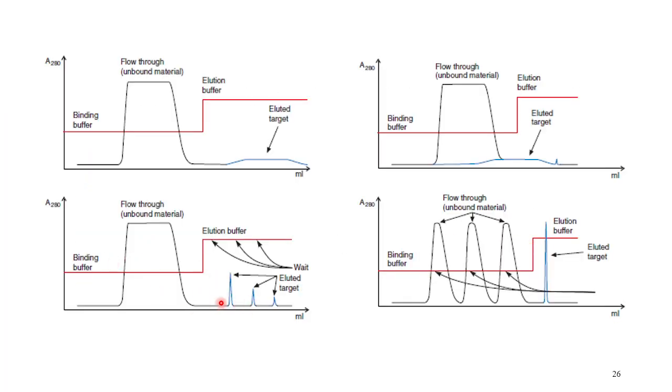Sometimes you observe that you get two to three peaks, or one peak might be a shoulder of the other peak. That is a very complicated situation, and purifying all of those fractions becomes very difficult. In that case, what you can do is purify the protein using size exclusion chromatography. There comes no concept of affinity, and there you can separate the proteins if they are forming oligomers or are of different sizes.